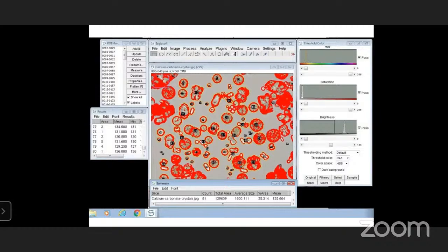Now the second important thing is calibration. Okay, so after the capturing of the image you can calibrate. First of all, calibrate this image by using the pixel. Here you see at the top there are 800 by 640 pixels. So pixel depends upon different image scale.